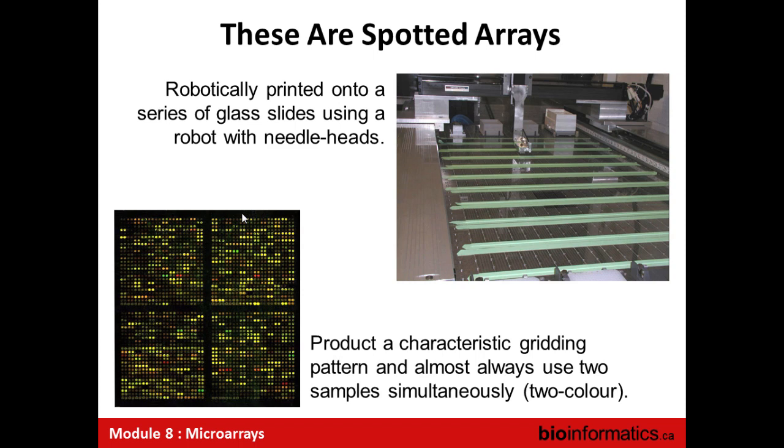They can be. So that example of pre and post treatment is widely done in cancer studies. So it'll be the changes, and those are frequently done on the same two-color array. So it's not a practical problem in terms of hindering your microarray analysis in some deep way.